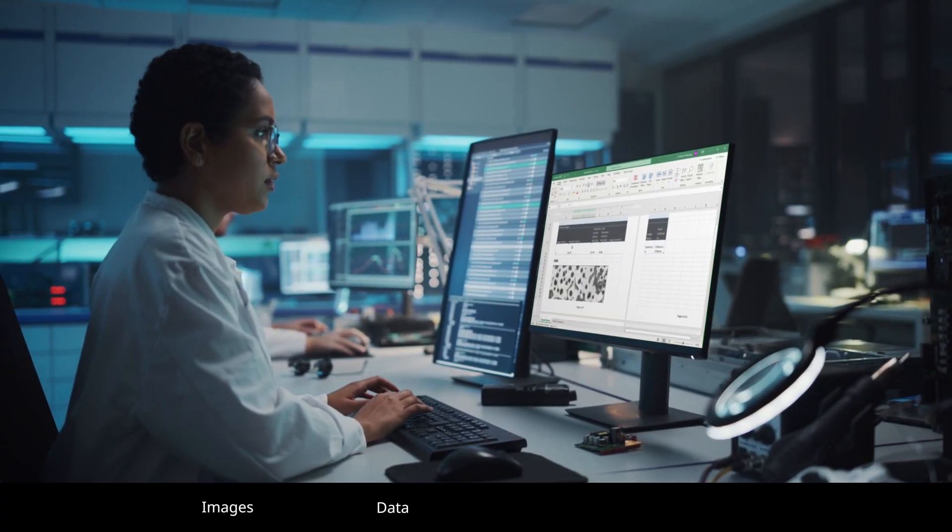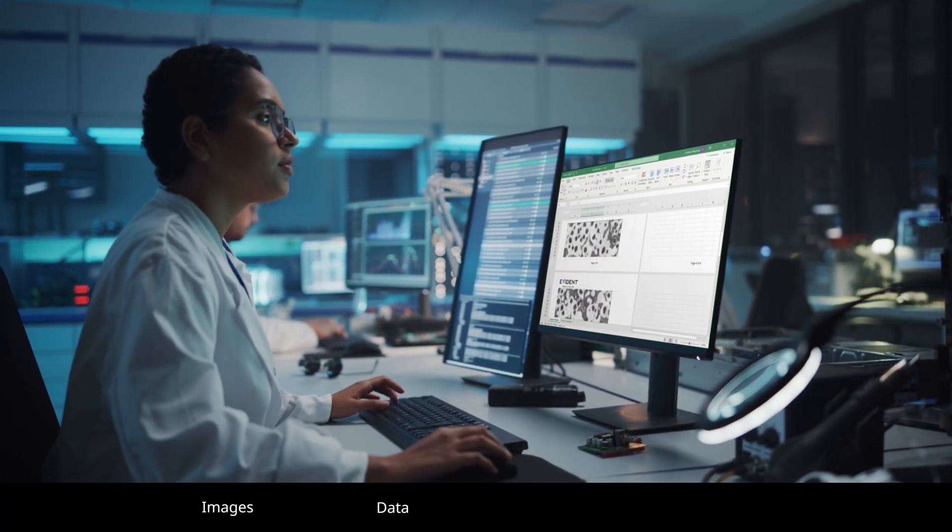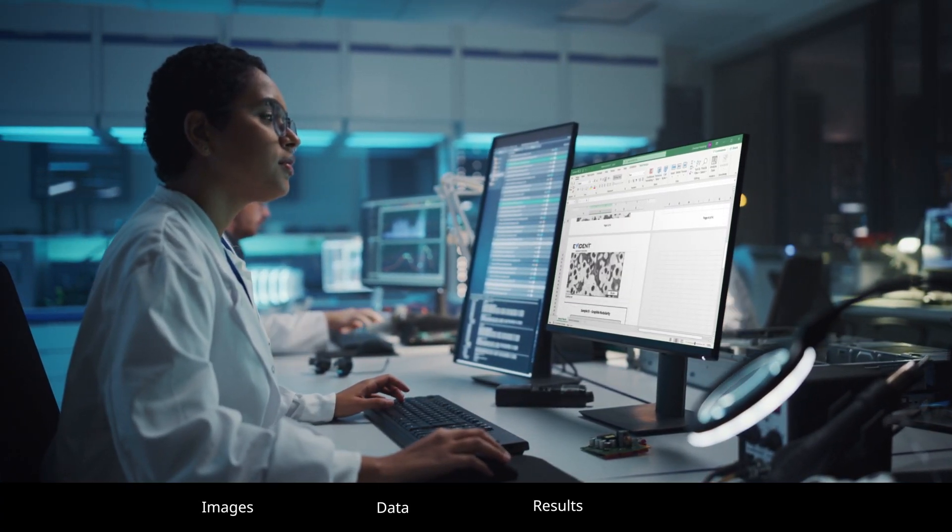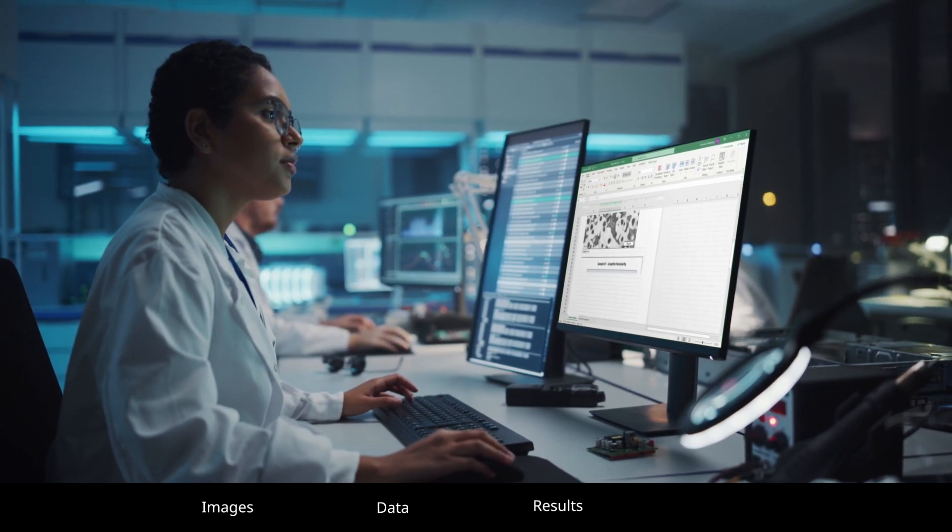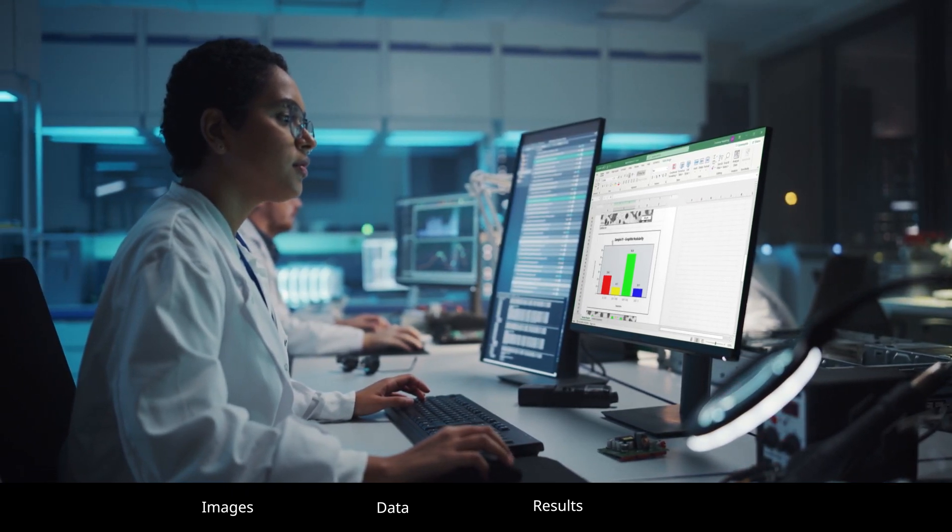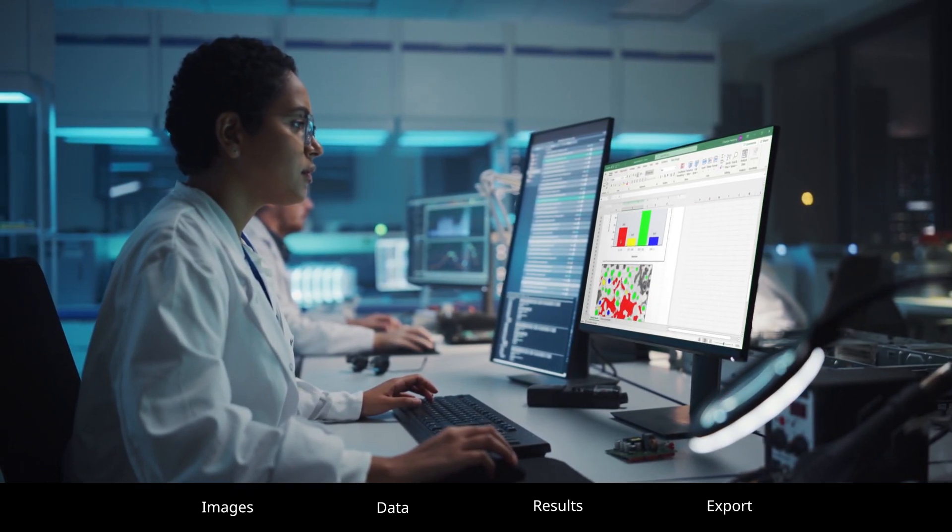Images, data, or professional reports created inside the software can be easily exported.